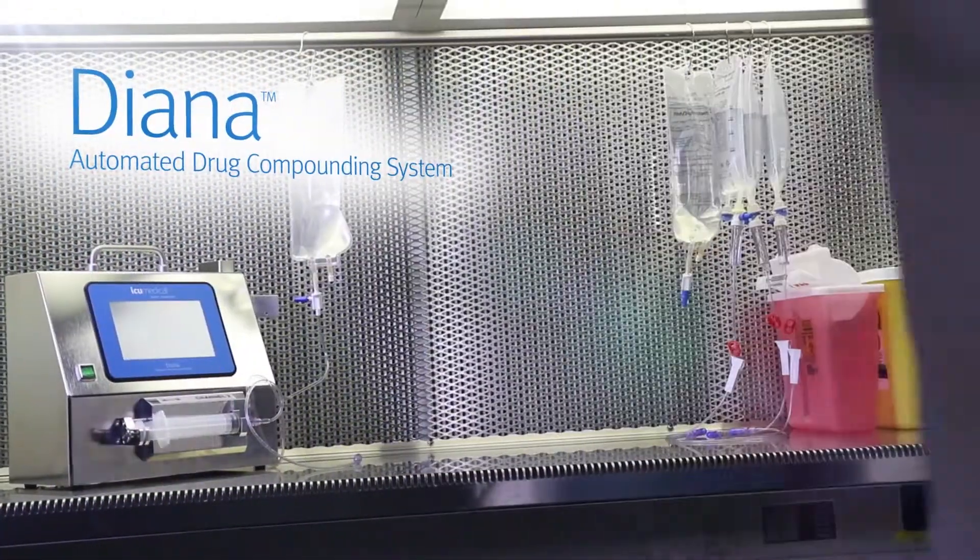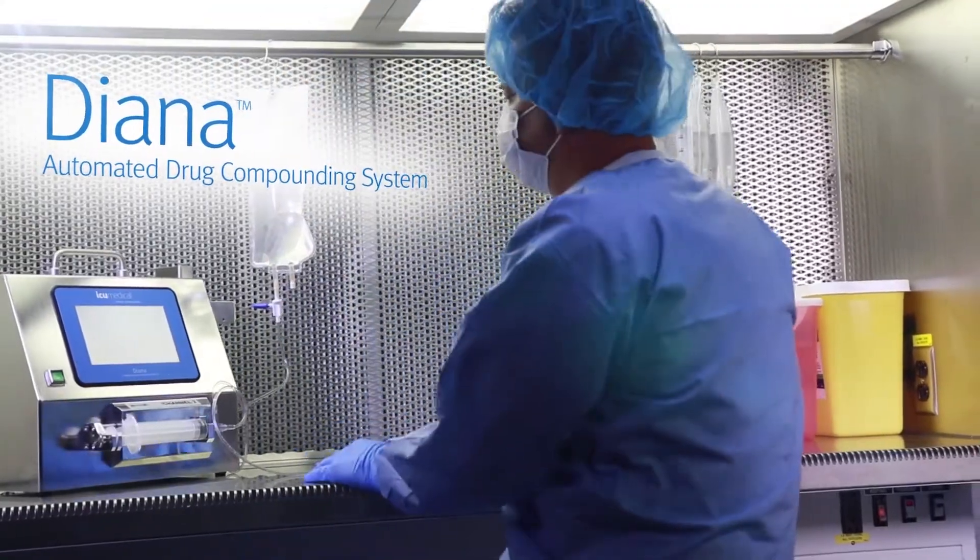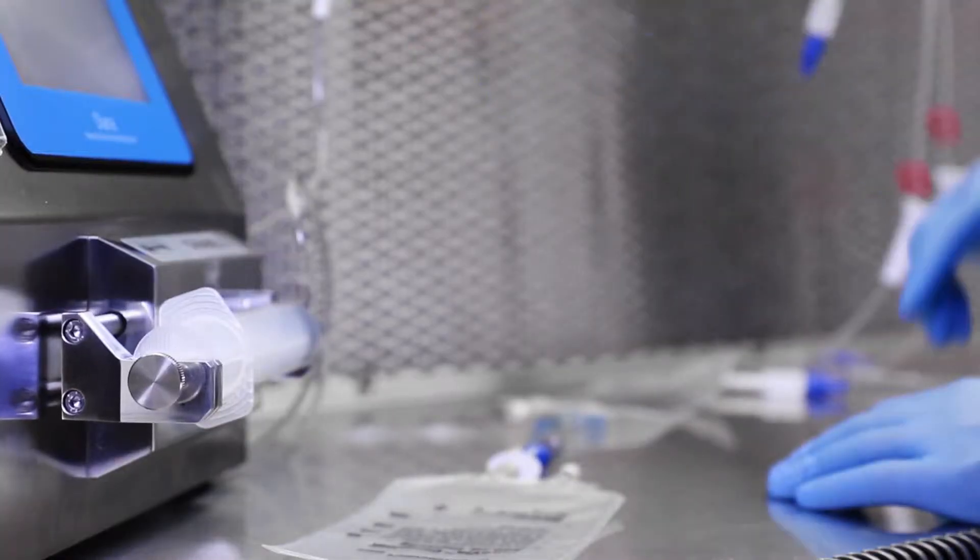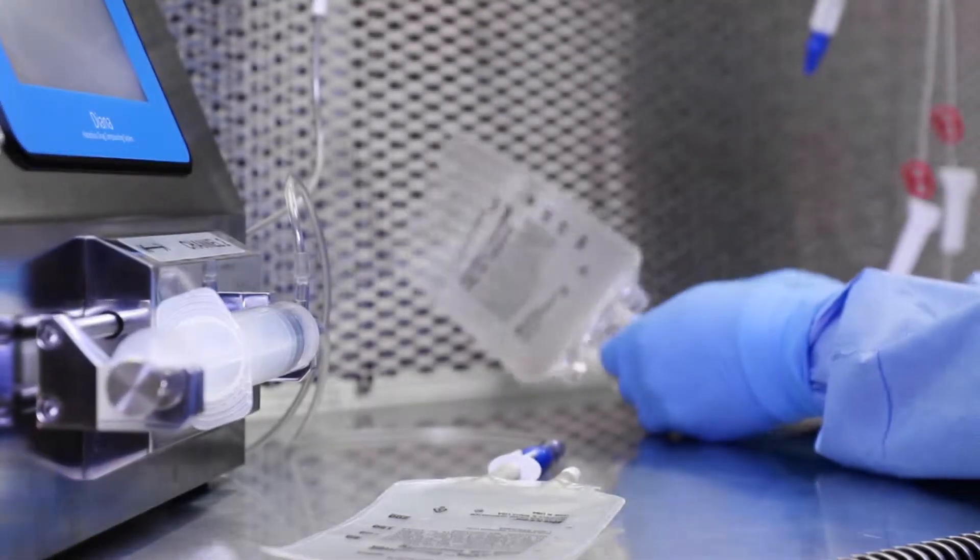That's why we designed the Diana Automated Drug Compounding System to take the physical stress away from technicians and help you streamline the dilutions process.